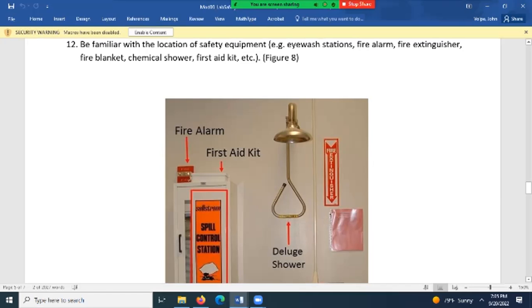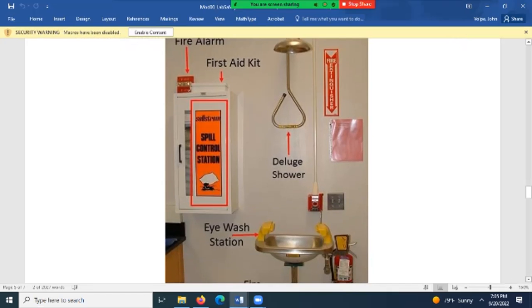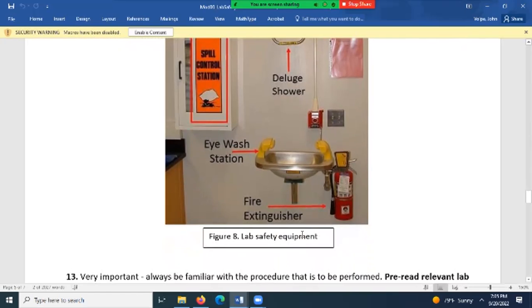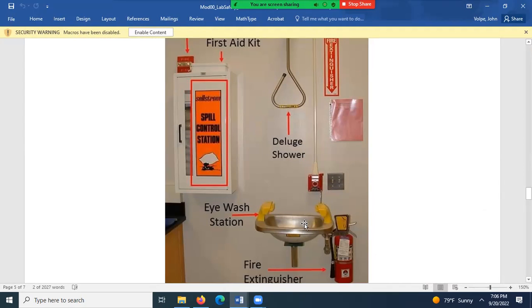I should warn you that if you were to use that, it gets water on the floor here. It's true we have a drain underneath to collect the water, but the whole area will be wet. Fortunately, I've never had a student needing the deluge shower. I think I've only once in all my years of teaching had a student use the eye wash station.